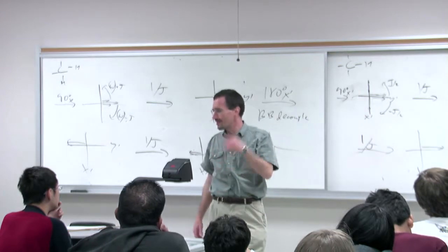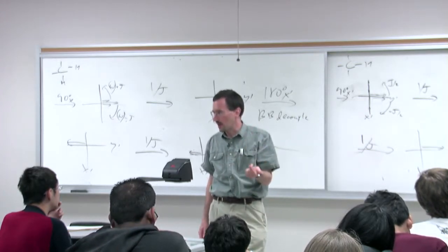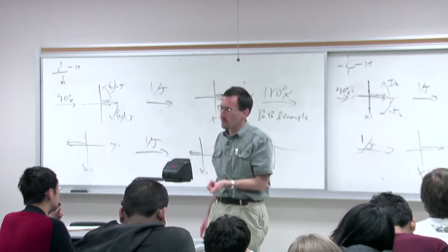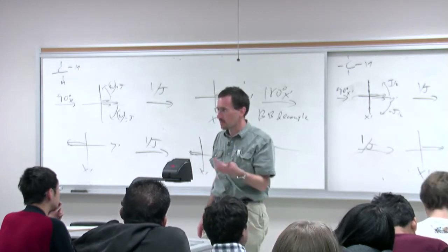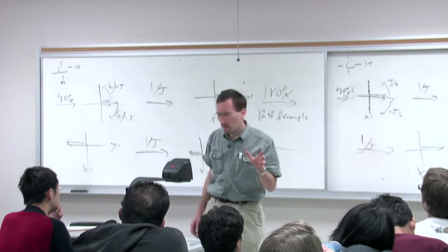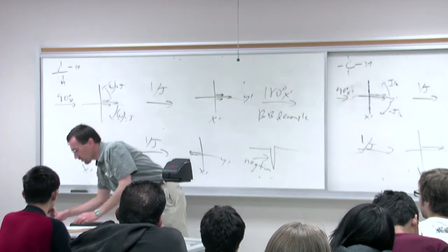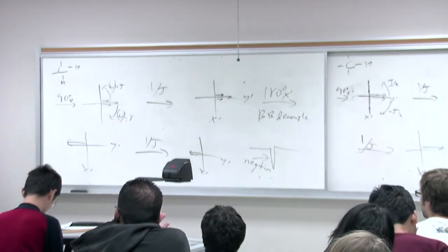Your peaks would be less intense. You'd have more artifacts and so forth. So the spin echo gets incorporated. And it gets incorporated into all of the experiments that we won't go into a lot of depth on, like the HMBC experiment, where we're going to use it but not necessarily understand it quite as well. All right, let me show you one of these experiments.